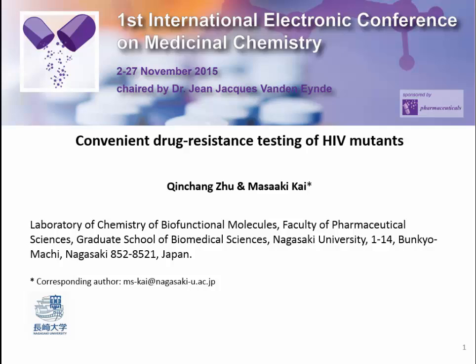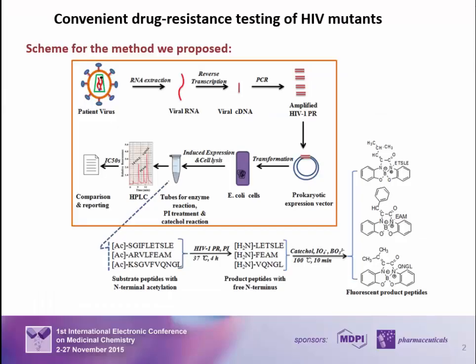It's my great honor to join the first International Electronic Conference on Medicinal Chemistry and to introduce our research about a method for testing drug-resistant HIV mutants. Here is the scheme for the method we propose.